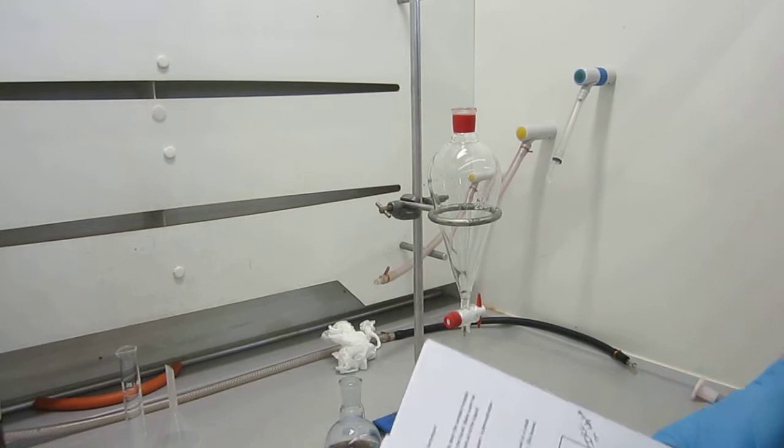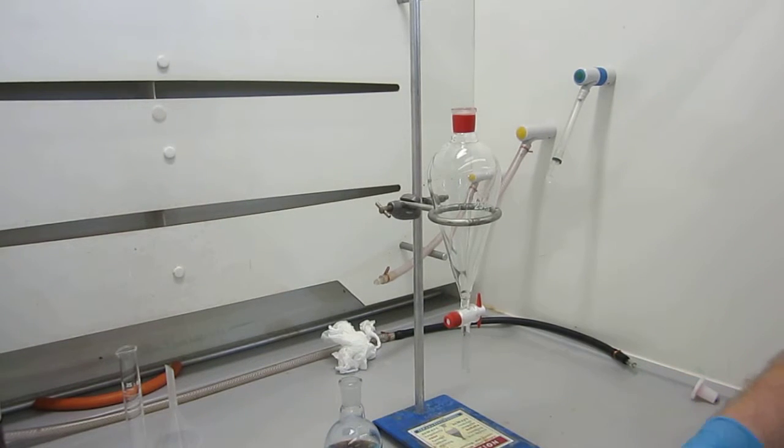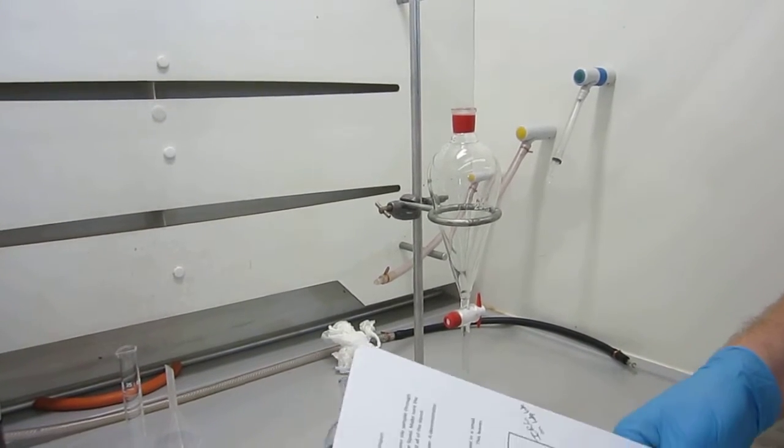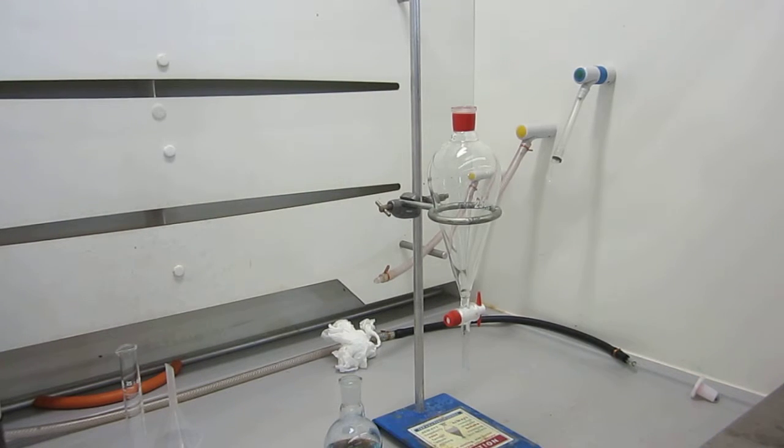So in this video we're going to be talking about solvent extractions. Solvent extraction is a purification technique used to separate one component from another or many components. Generally it's the extraction of a compound, normally a product, from a reaction mixture as a solution into a second extracting solvent. The fundamental idea is that we take the reaction mixture, remove the product or remove the impurities, and leave a solution with mainly just the product that we can then go on to use and purify further or analyse.